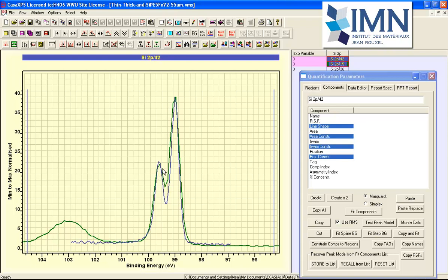We also see that the data has elemental silicon. And we can see that the resolution of the elemental silicon when we have this oxide is not as good as the blue spectrum, and this is because these were measured using different operating modes. So the line shapes between these spectra will be slightly different due to the operating modes. What this does show us is that we have a good valley between these doublet peaks, indicating that we really have a reasonable energy resolution, and that if this is an oxide peak, then the blue spectrum does not indicate there is any significant amount of oxygen associated with this region here that we would expect to be rising as a consequence of this oxide peak.